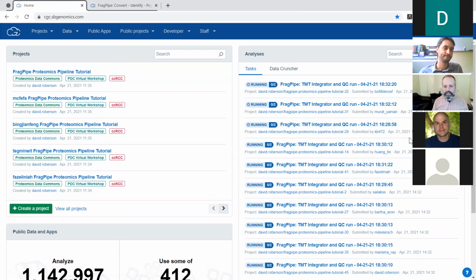Sure, thanks. By the way, it's really exciting for me. I jump back out into the platform dashboard, and that's where you can see the overview of all the projects you're in. So I'm in everyone's webinar project. It's really exciting that I see everyone has made it to the last workflow already.